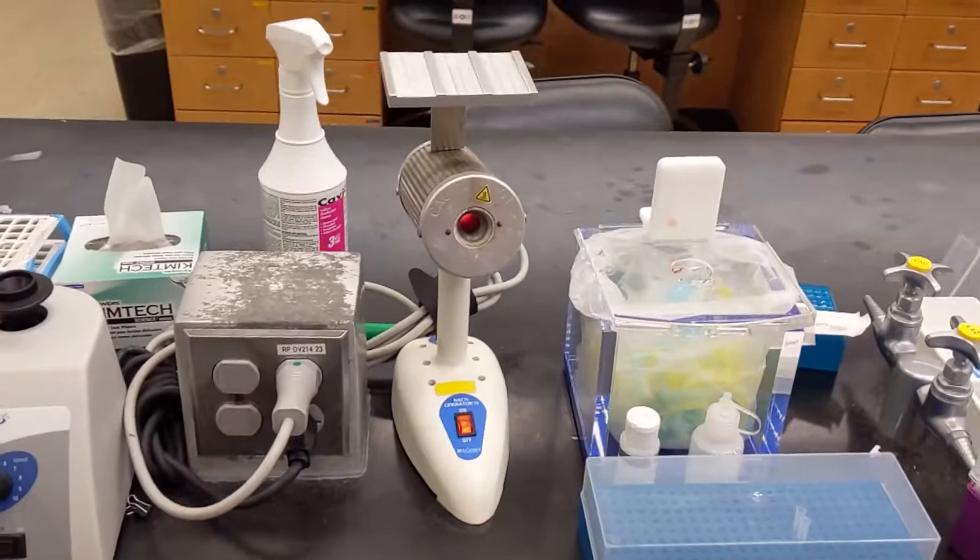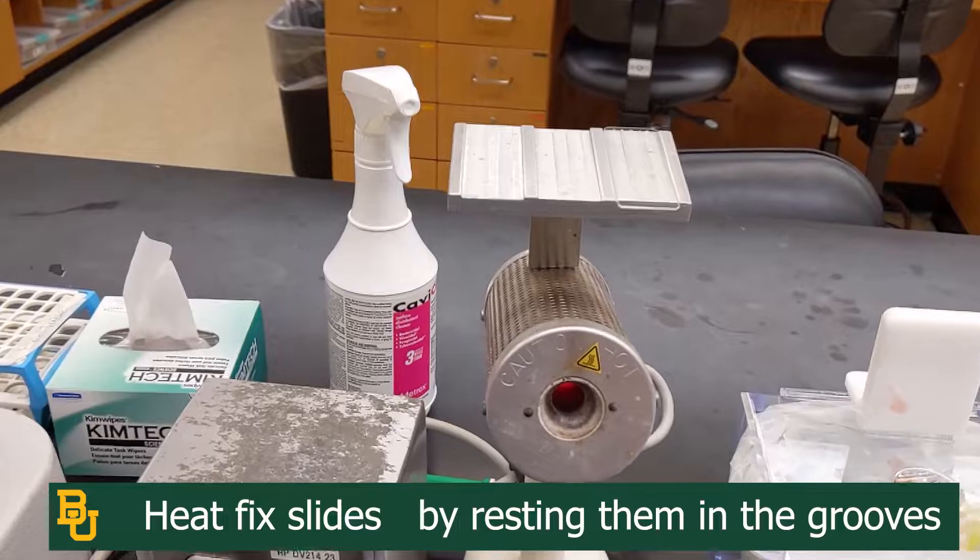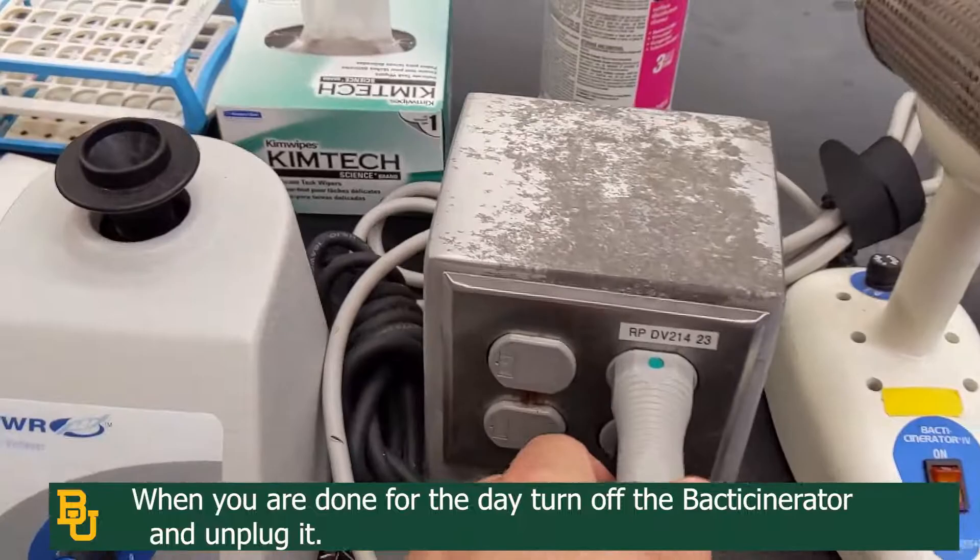Once it's sterile, you can take it out and let it cool down or set it down. You can also use these back decinerators to heat-fix slides once they have bacteria on them. They have small grooves in them to keep slides flush, and thus you'll be able to use them.